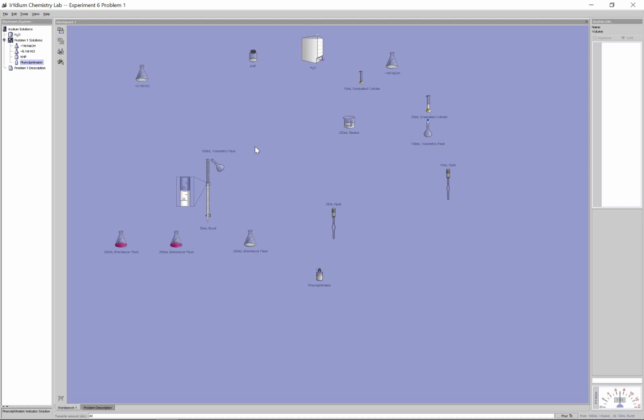21.22. You see all of these sort of problems come along the way here. We have a 25 ml sample here. This one here may actually not be enough, but we'll give it a shot anyways. The other thing you could do is you can say, oh, I actually don't have enough solution. Of course, I can dilute another sample, but the problem is if I dilute the NaOH, even if I use the same recipe, 8 into 100 ml volumetric flask, there's always going to be a little bit of uncertainty here. The concentration here would still be a little bit different.